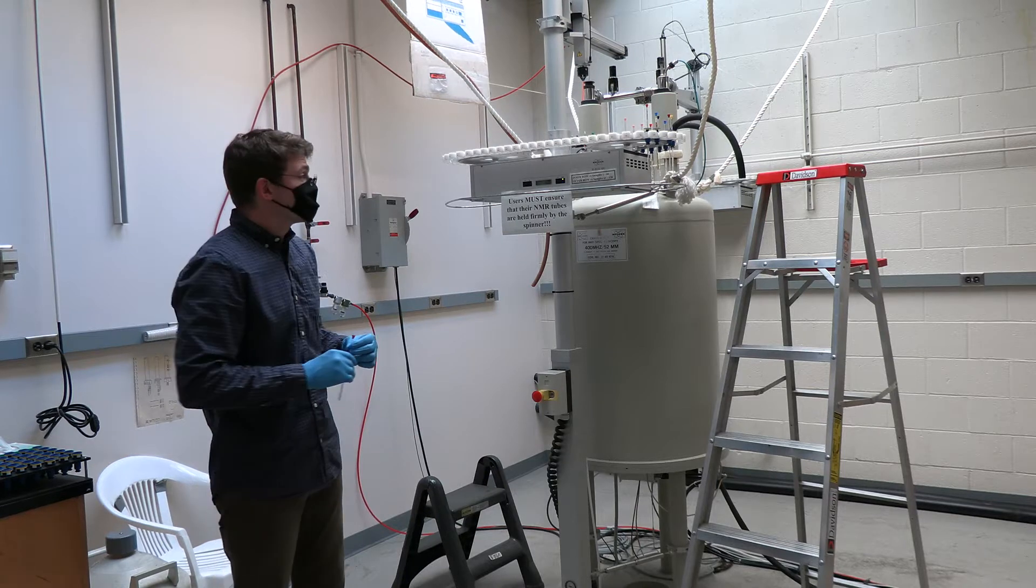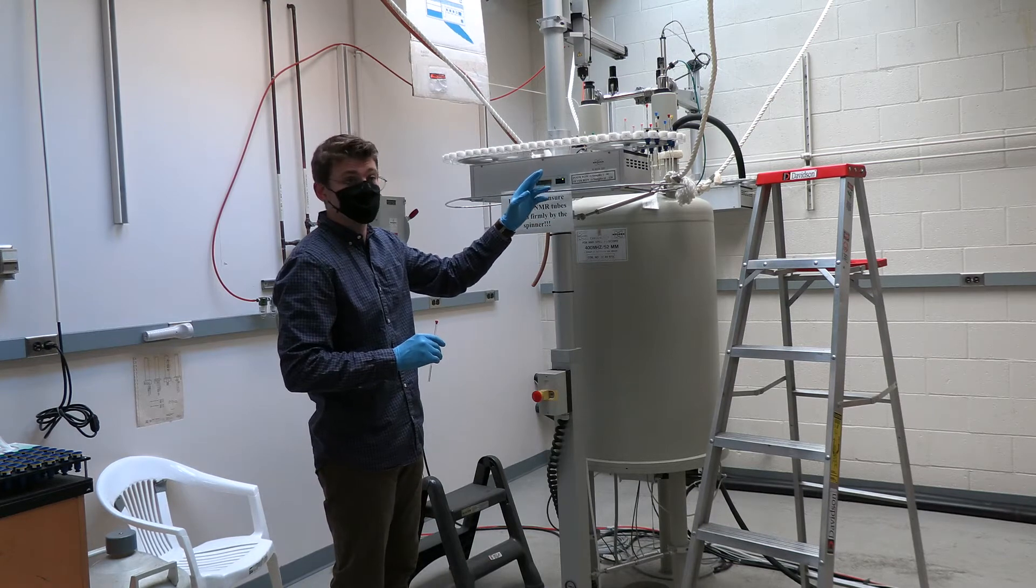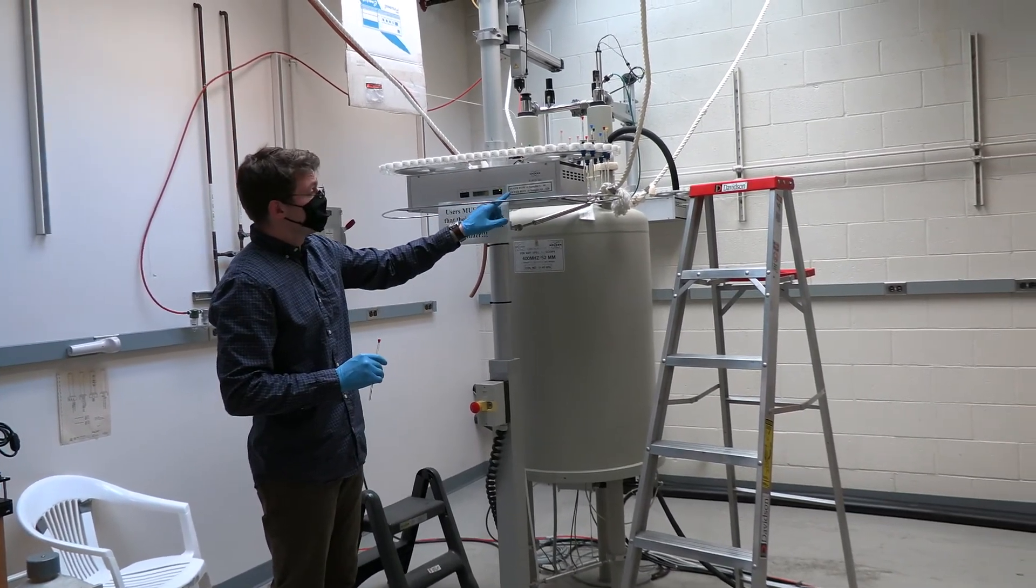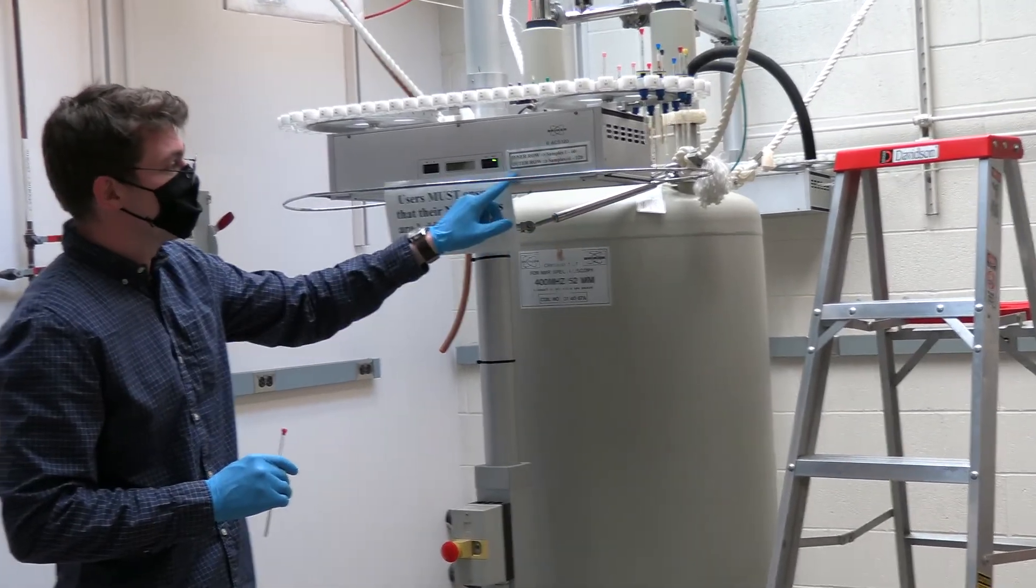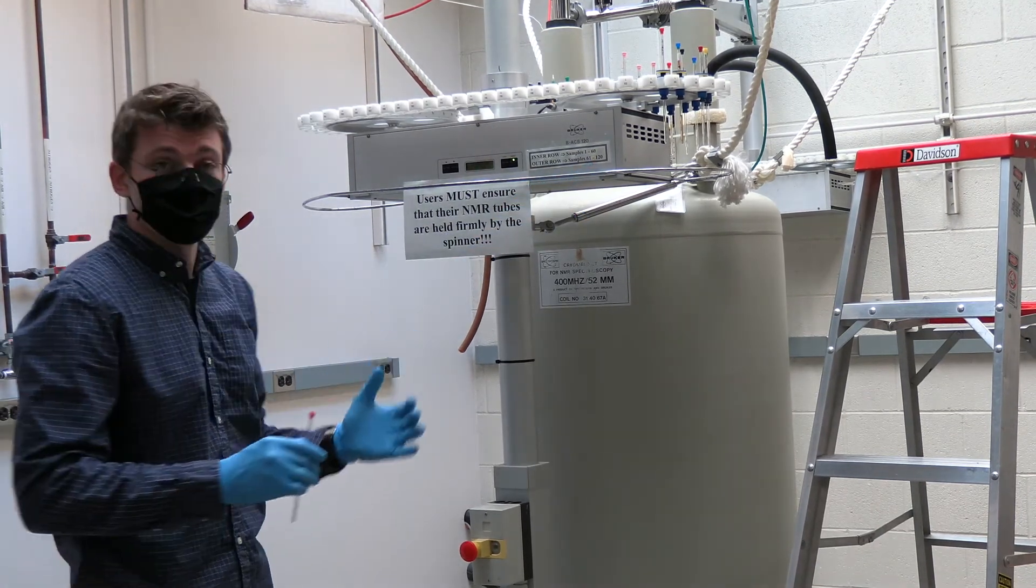The next part of this demonstration is to show you how to physically place your sample up on the carousel. When placing your sample on the carousel you'll notice that there are two rows in which you can place your sample, an inner and outer row. As shown on the sign the inner row holds samples 1 through 60 while the outer row holds samples 61 through 120.